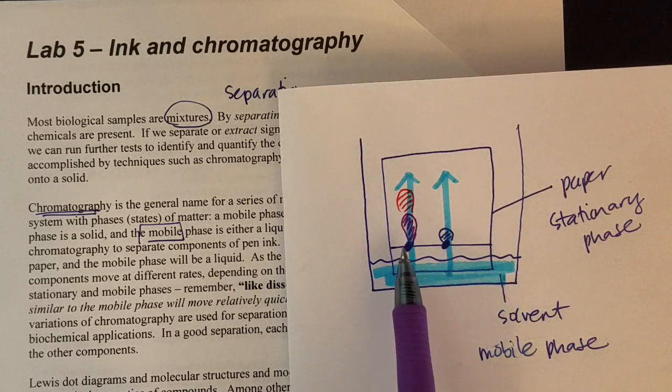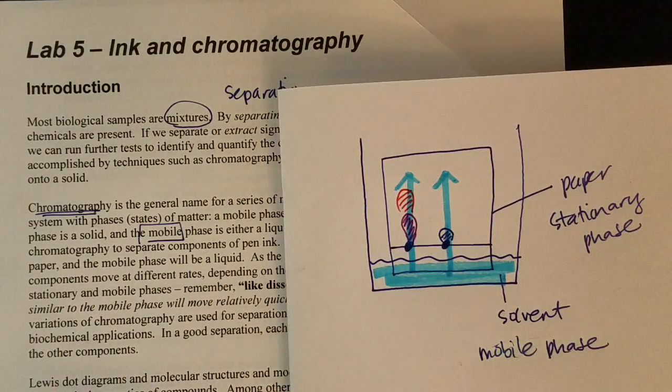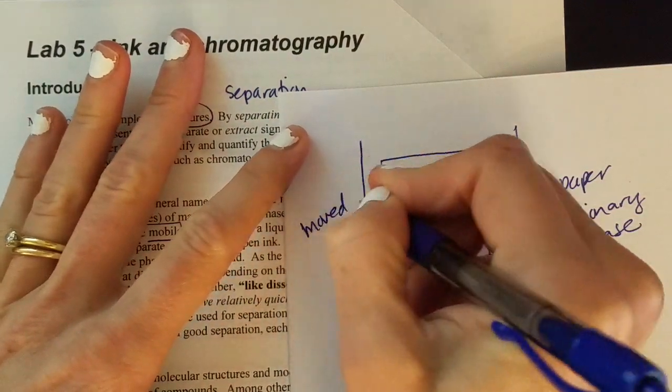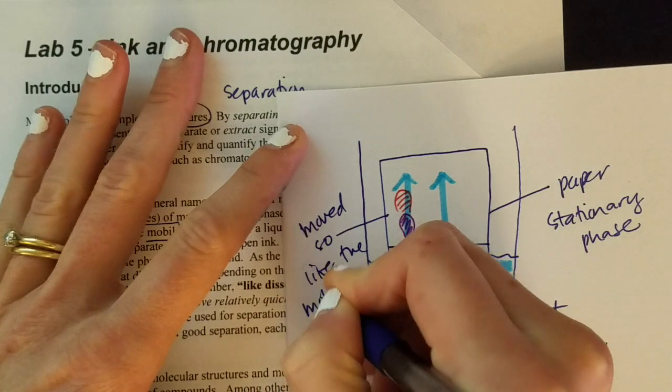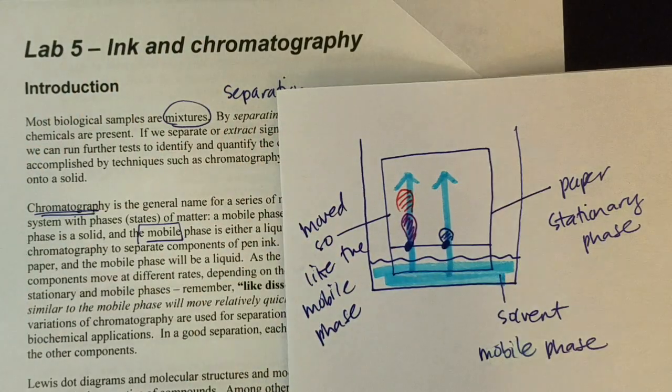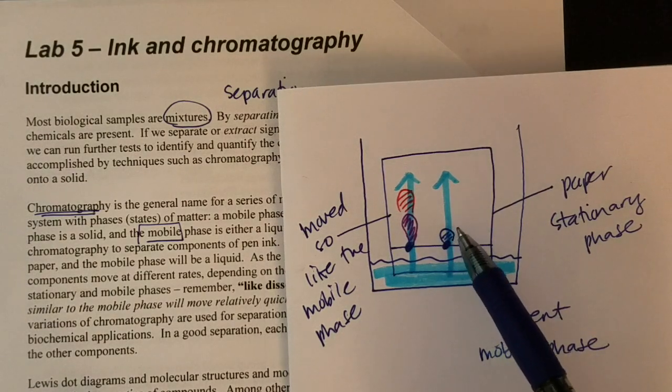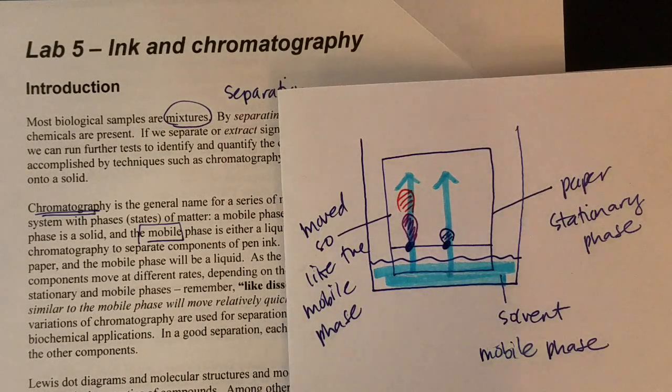In this case, I would say that these inks over here, the ones on the left, they moved and so they are like the mobile phase because like dissolves like. Over here, these inks did not move and so we would say that they are more like the stationary phase or the staying still phase.